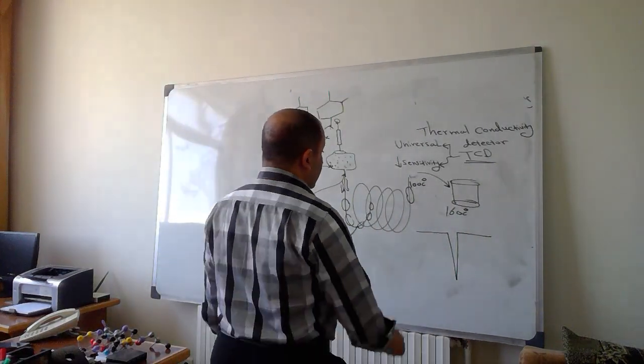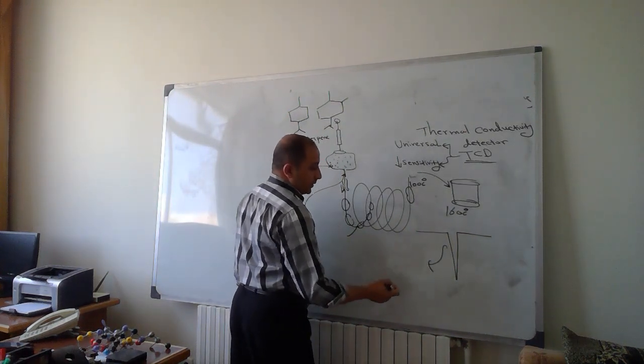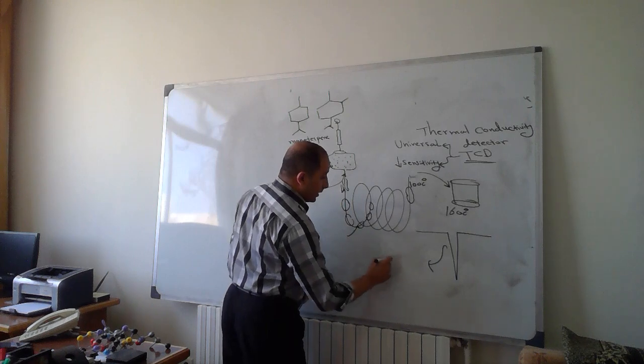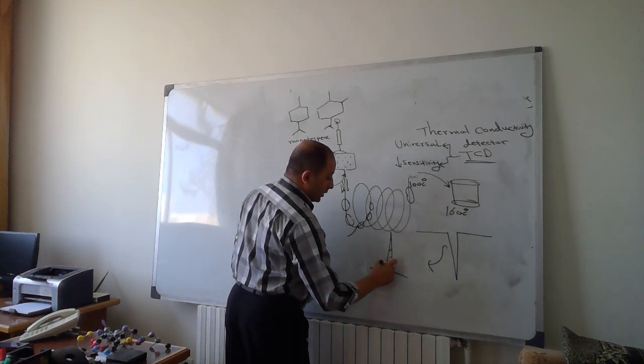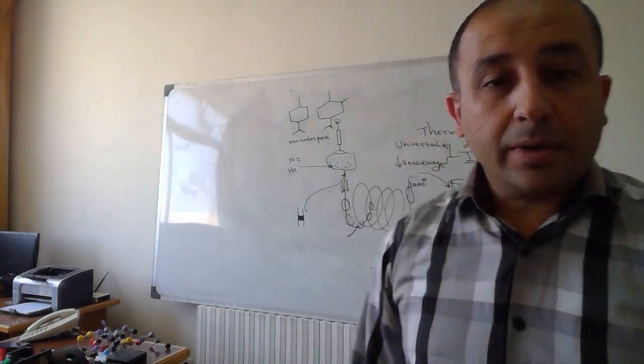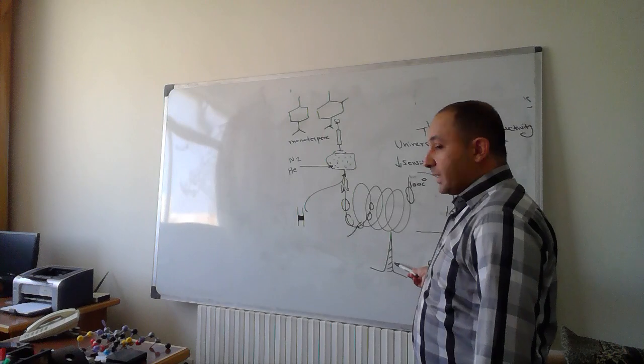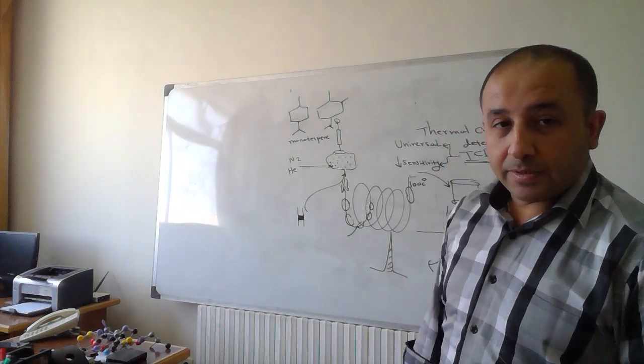Now, if the computer inverts this peak, the inversion apparently will restore the common type of signal, which is a peak like this.